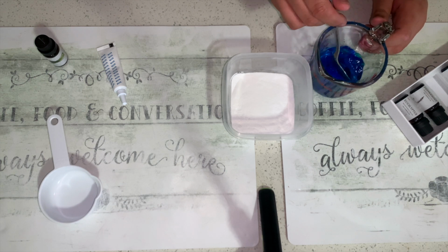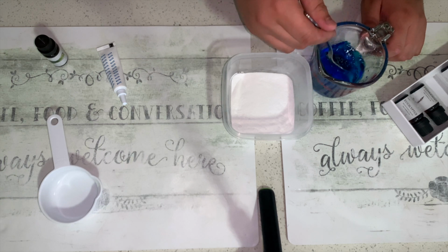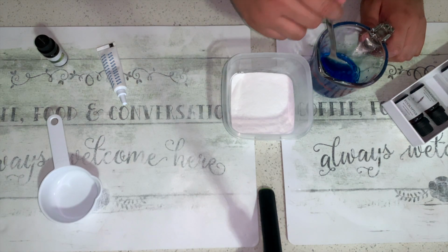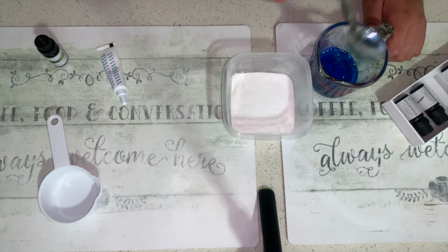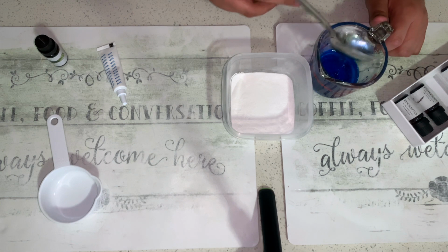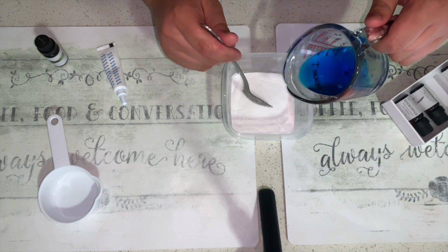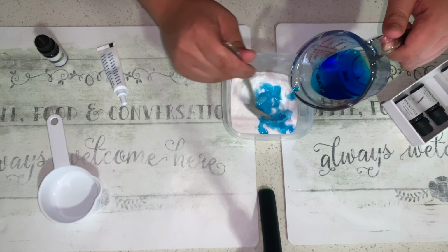So I just mixed it together and started adding it slowly to the sodium bicarbonate. As you can see, I'm about to start pouring water little by little into the sodium bicarbonate so it doesn't have a big reaction.